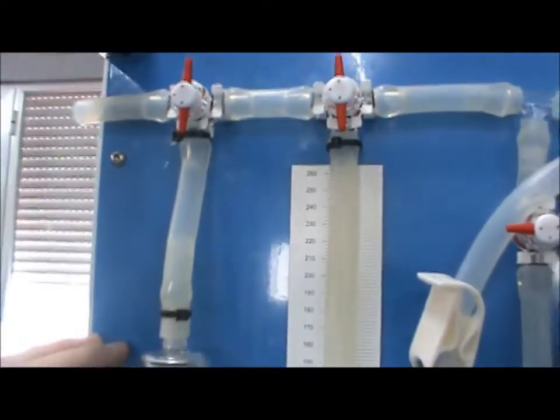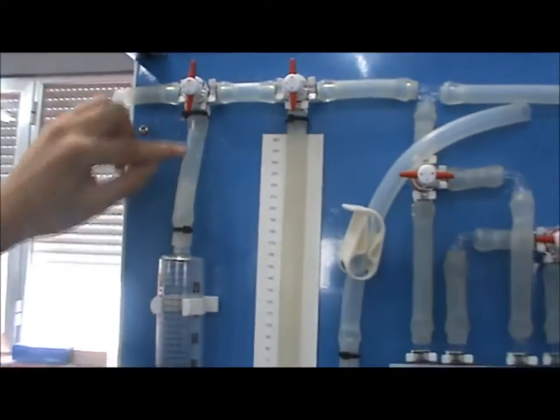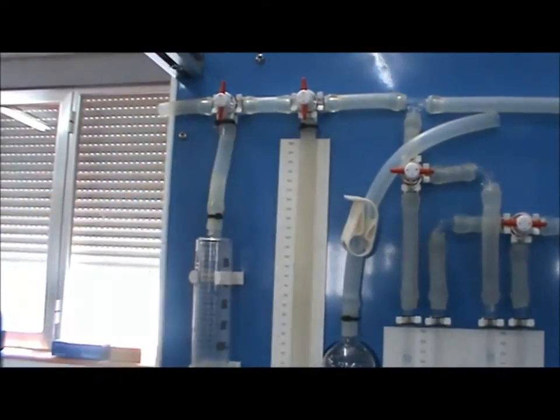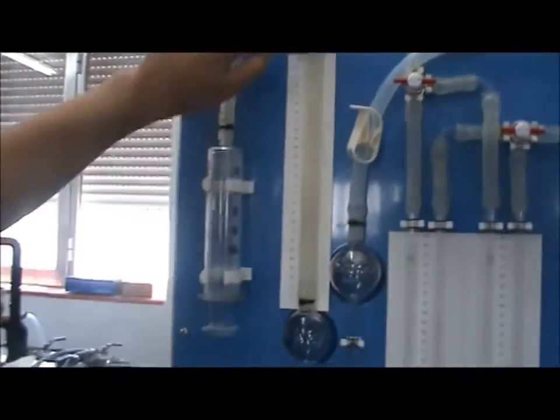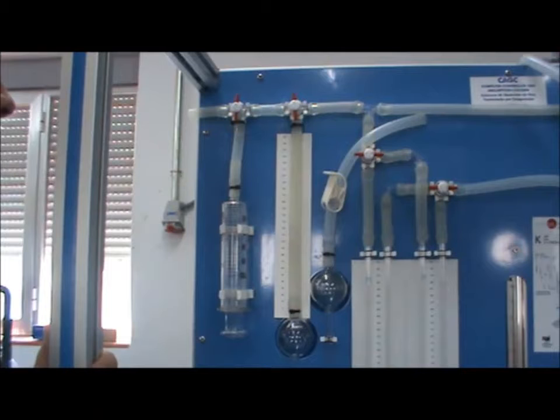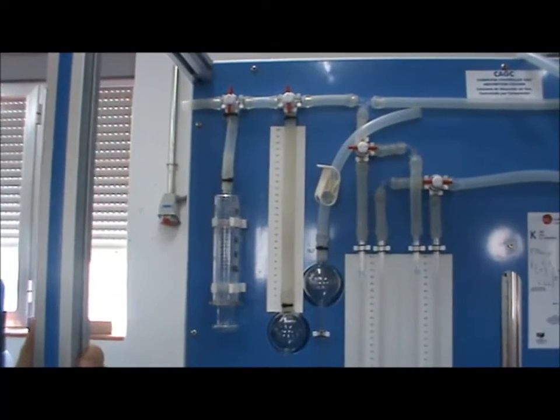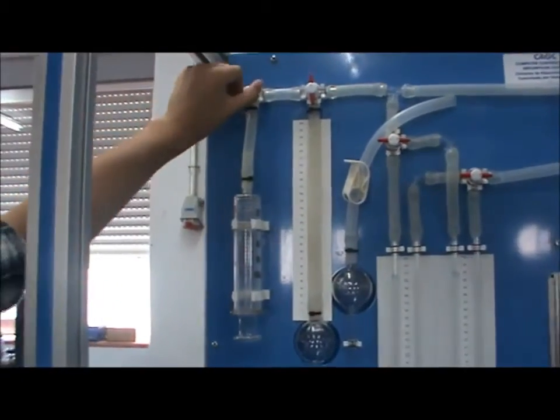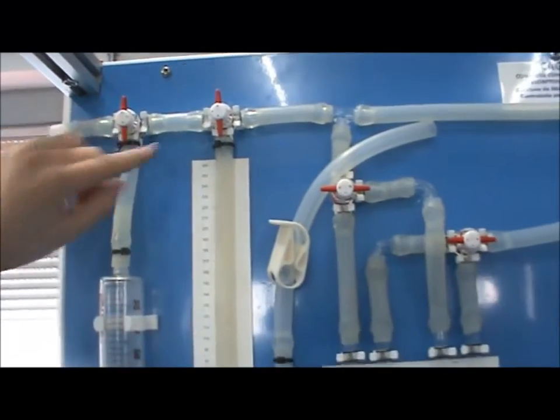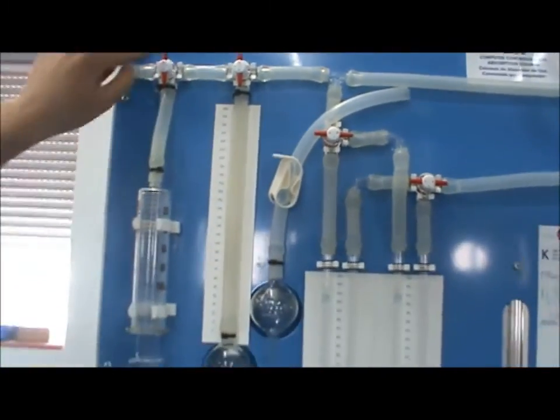Arrange valve VT3 to allow air to flow from the syringe to the atmosphere, and arrange valve VT2 to connect to the U-shaped vessels. Make sure the syringe is fully compressed by expelling the air to the atmosphere. Close valve VT3 to the atmosphere, which connects the syringe in this circuit, allowing it to charge the KOH solution to the vessels.